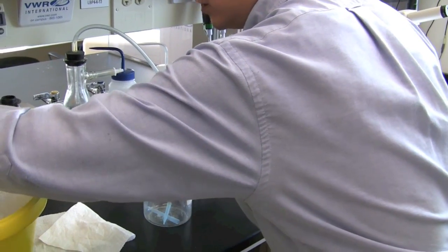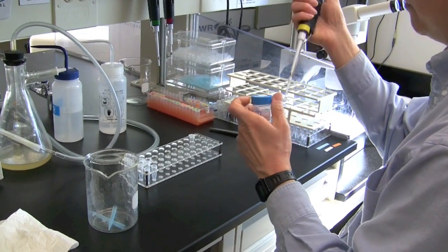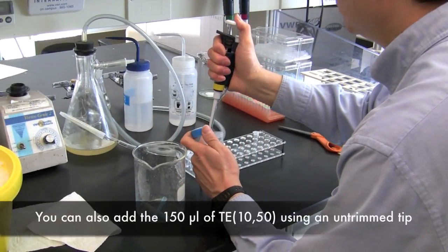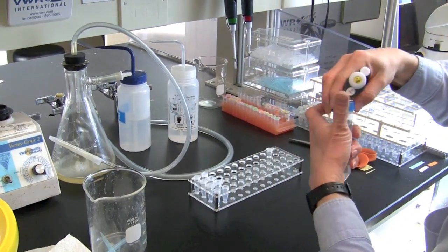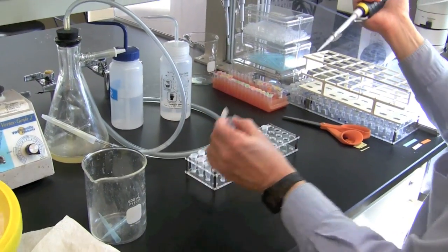I'm going to take my TE1050 solution. I'm going to add 150 microliters to each tube. And now I'm going to resuspend.